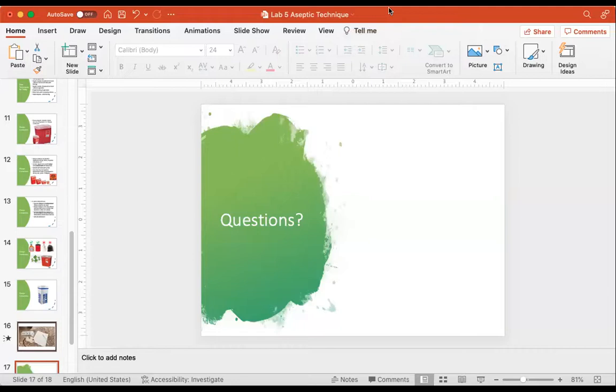So, does anybody have any questions about what we've talked about today? We talked about what aseptic technique is. It's actually a collection of things that we do in order to meet our most important goal. Don't contaminate yourself and don't contaminate your culture. Okay, those are your two big goals. And we have to use techniques in order to prevent those things from happening. We have to handle our culture containers carefully. We have to always be thinking about where contaminants might be coming from.